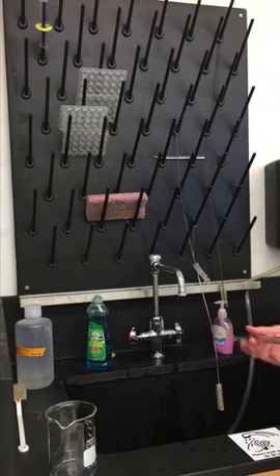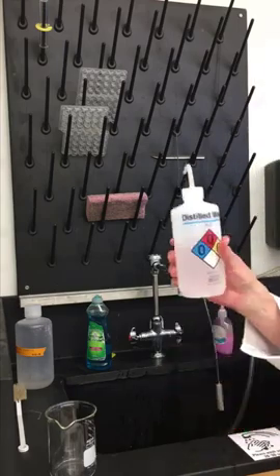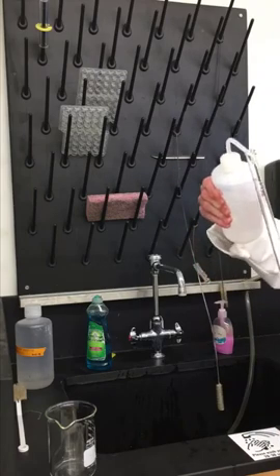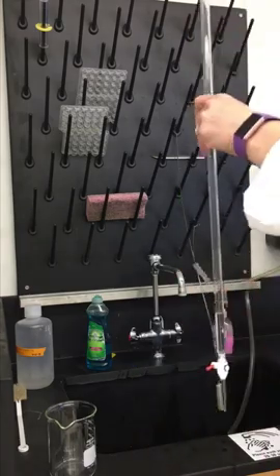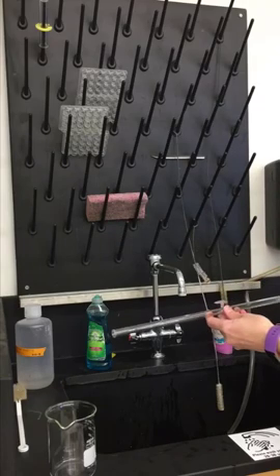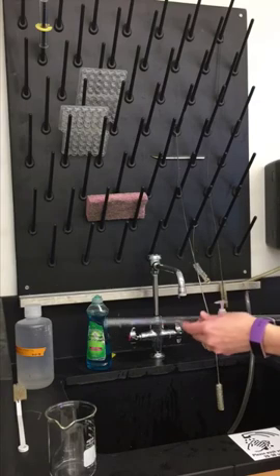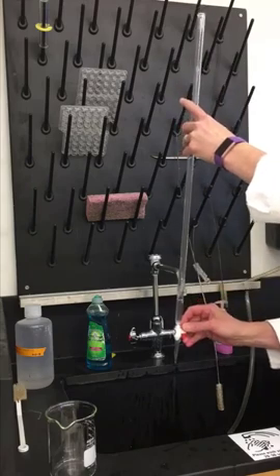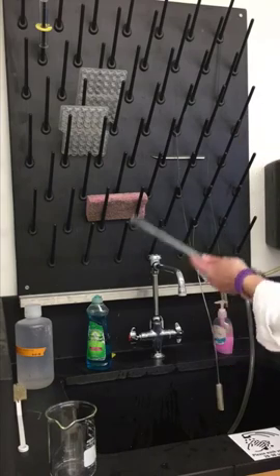Now I want to rinse with distilled water, because tap water has ions in it that might affect our results. Just fill it a little bit — about five milliliters — then rinse the walls of the glass over a waste beaker, let it run through the tip and rinse. You need to do a rinse with distilled water three times.